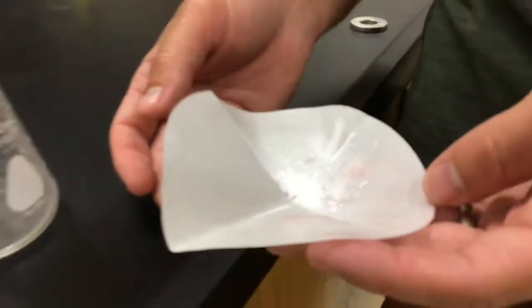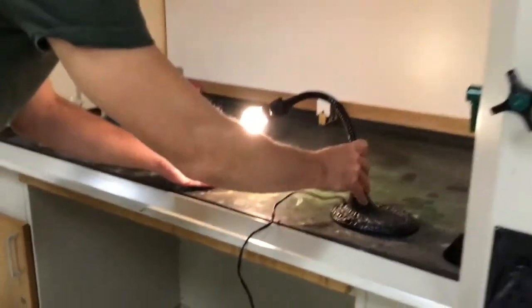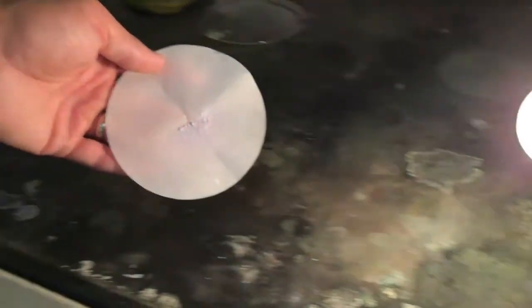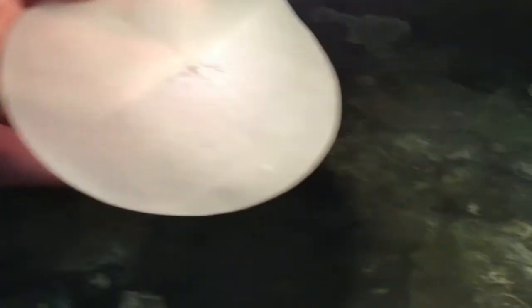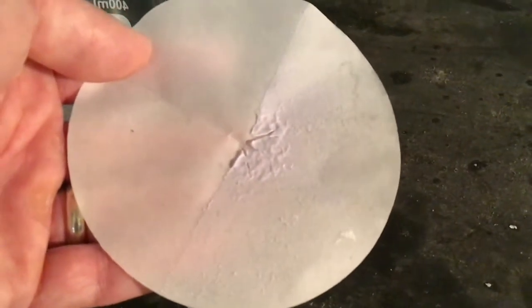Now we're going to walk this over to our fume hood and place it right here in the light, then come back and check after a little while. Looking at the filter paper that was by the light, you can see it's got a little bit of a lavender tinge to it now — it's not that pure white anymore. The light has caused it to change to a more lavender color, though it is a little hard to see in the video.